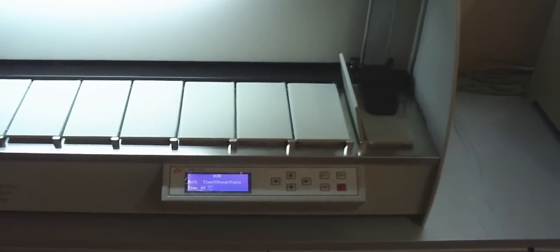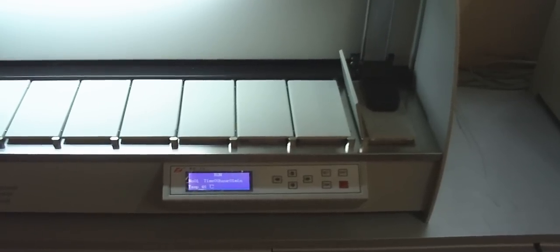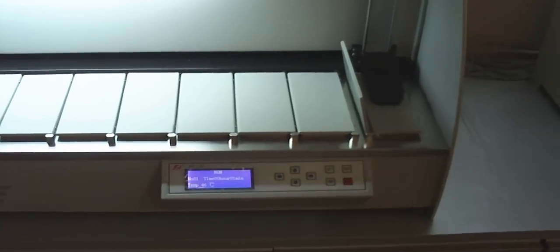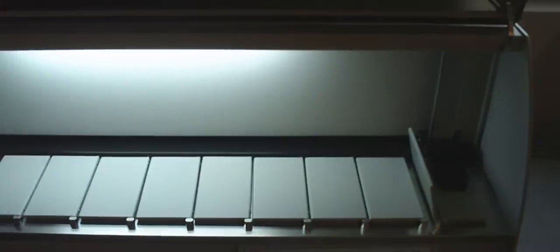After finishing working, turn off the power and clean the instrument.